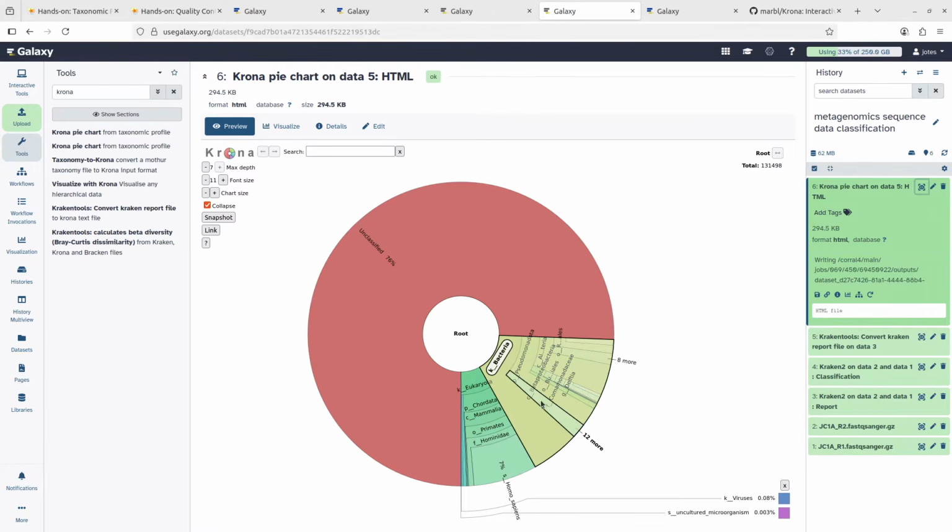Sometimes you'll be dealing with specific extracts, and for these extracts there are likely to be some normal bacteria which are supposed to be there. So if you do this classification and you see these organisms, it gives a confirmation that yes, you are dealing with the right extract. Or if the suspected organisms are not there, that can let you know that something is wrong or there's an anomaly, so you may want to check them out.